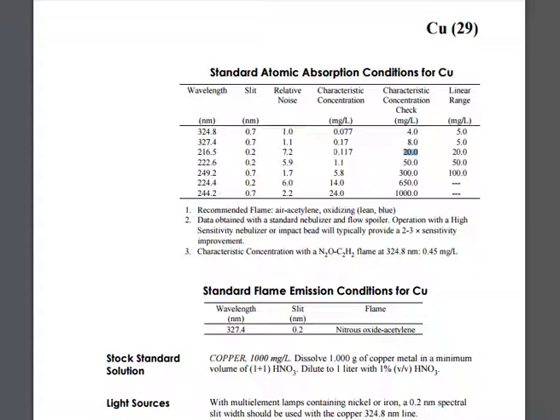I can run samples. And this linearity range goes to a 20. All right, so to a 20 means that this is a more concentrated sample, higher levels. I can go a little higher on the calibration curve. The problem is that it's not going to do me justice at the lower end of the calibration curve. I trust it more in the mid-range than I do at a 0.5 or a 1 or a 2 part per million.